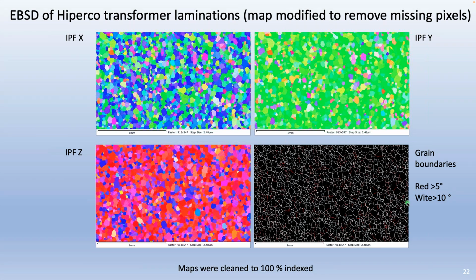Okay. The next question is, is detector binning, dwell time, or indexing speed important to include as well? And I believe that's referencing what needs to be included with your EBSD data. I again think that's additional data, and more data is not bad. I think the more transparent we are with how we set up our experiments and how we achieve the data that we have is welcome.